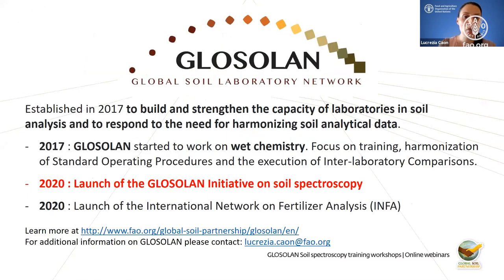I mentioned GLOSOLAN. GLOSOLAN is the Global Soil Laboratory Network, established in 2017 to build and strengthen the capacity of laboratories in soil analysis and to respond to the need for harmonizing soil analytical data. In 2017, the network was established and started to work on wet chemistry. We focused a lot on training, harmonization, standard operating procedures, the execution of inter-laboratory comparisons, and much more. Then in 2020, we launched the GLOSOLAN initiative on soil spectroscopy. And right at the end of last year, again under GLOSOLAN, we launched the international network on fertilizer analysis called INFA.